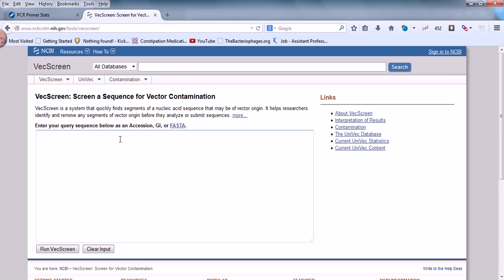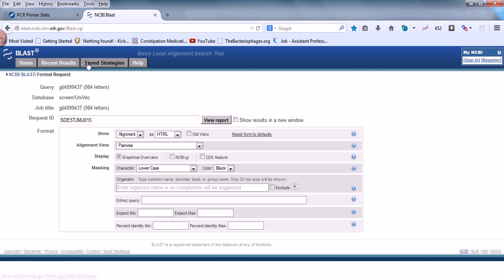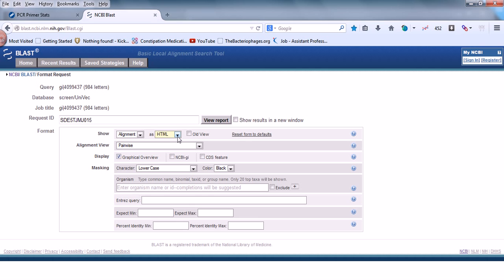You can put in an accession number, GI number, or a FASTA format sequence. I'll be putting the accession number 4099437. Just enter the accession number and click Run VecScreen. It finds your particular query — a 984-letter long query. You can look at alignment format options: UniVec, HTML, ASN.1, or XML. HTML is always the better option.